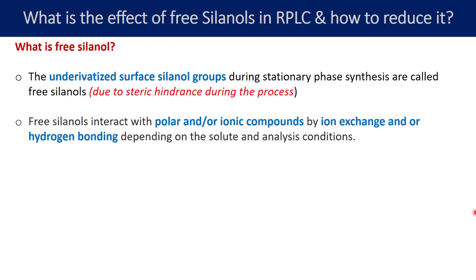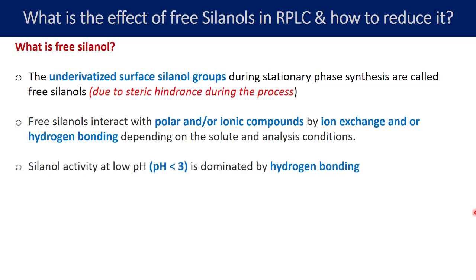Let us understand in what conditions ion exchange interaction is possible and at what conditions hydrogen bonding is possible. The silanol activity at low pH — if your pH is less than 3 — is actually dominated by hydrogen bond formation. Below pH 3, the silanol groups remain un-ionized, but hydrogen is still present on the silanol SiOH, and this hydrogen can form hydrogen bonds with basic analytes.